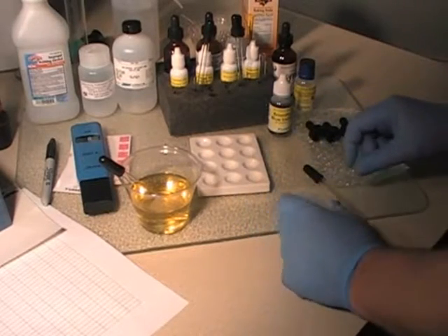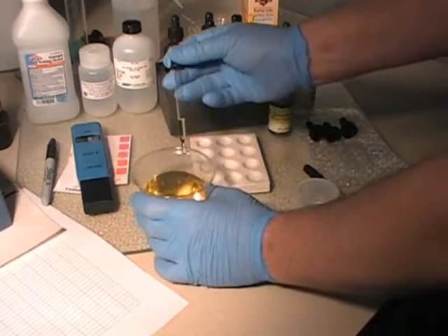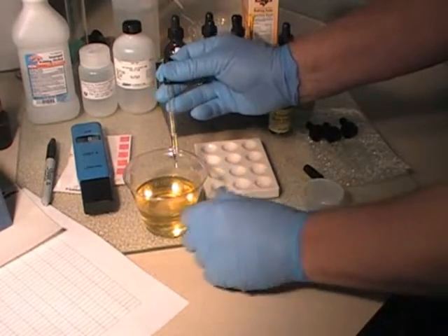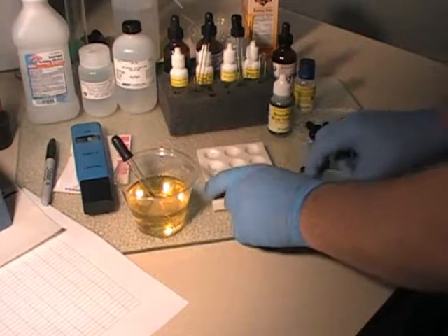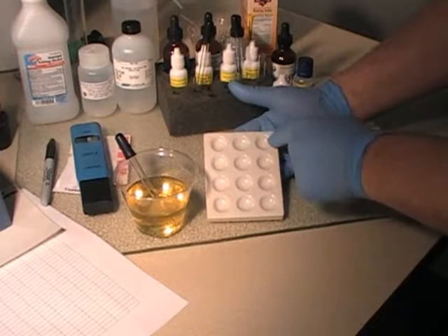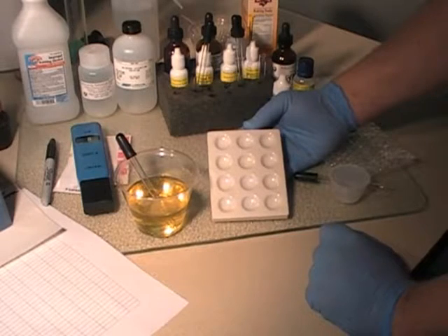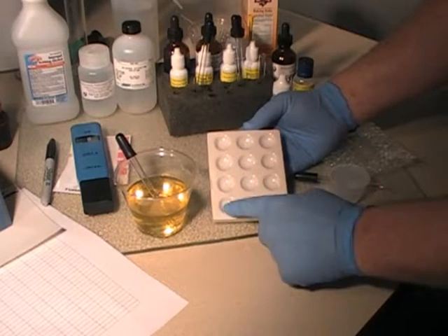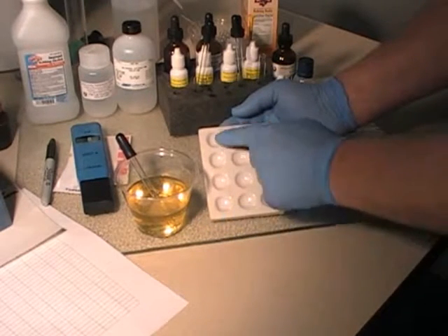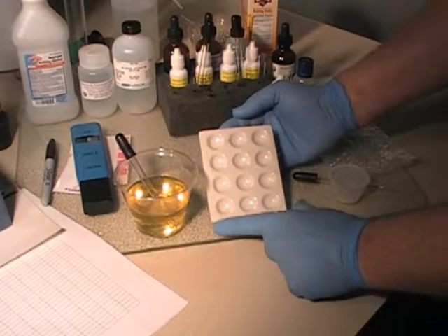So the first thing you're going to do is pull up some urine into your pipette. Let me first number these, okay? If you were to call these by numbers, this would be well number 1, well number 2, well number 3, well number 4, well number 5, well number 6. And if you wanted to continue, this would be 7, 8, 9, 10, 11, 12. So that'll help you remember. We're going to be using wells 1, 2, 4, and 5 in this test.